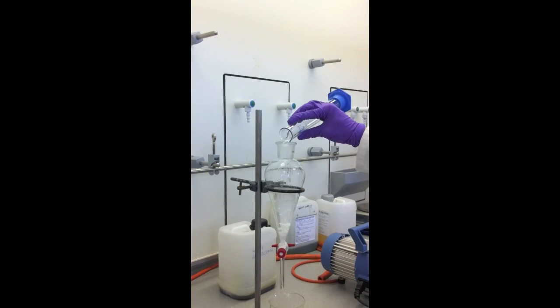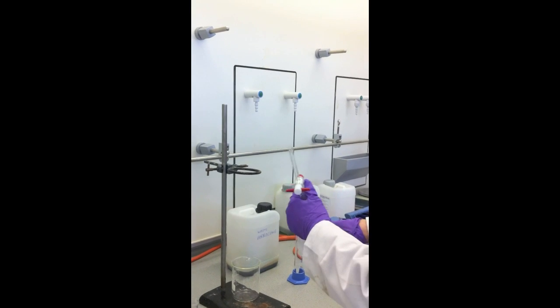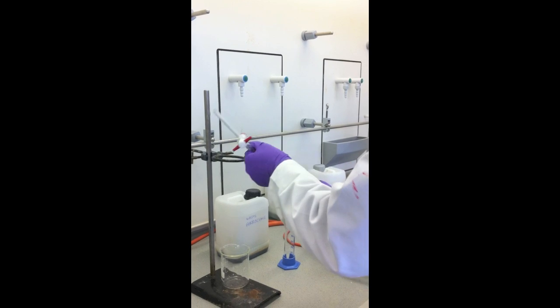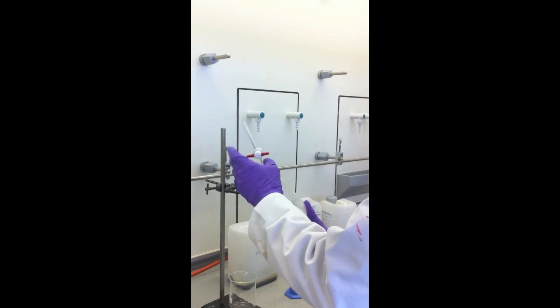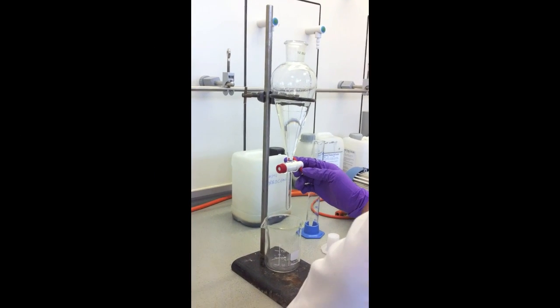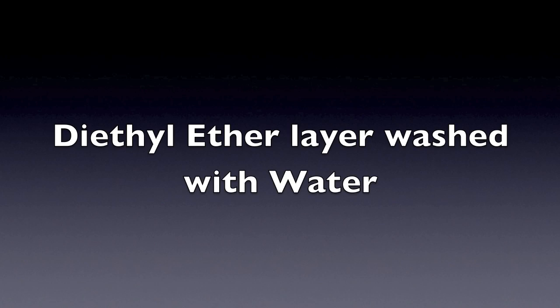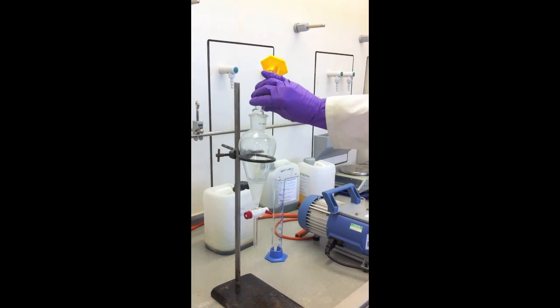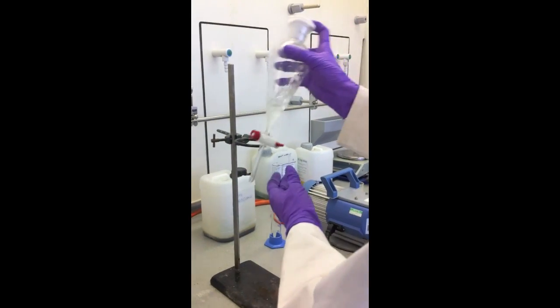To the solution, 50 ml of diethyl ether was added and the mixture was shaken in a separating funnel. There, the alcohol product moves into the ether layer while a lot of the impurities remain in the other layer, which is filtered off. At this stage, impurities that dissolve in water leave the ether layer and the water is again filtered off.